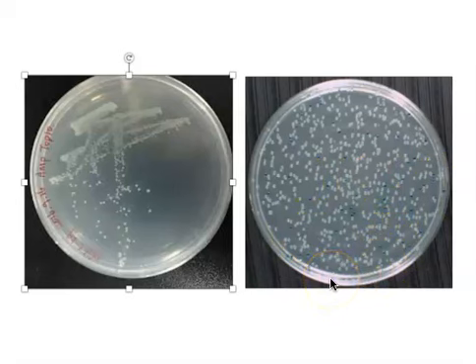Remember, we looked at the device that we use to do this, referred to as a hockey stick. It takes an aliquot of material, liquid material, and the hockey stick spreads it out evenly over the surface. The plate is then put into an incubator and allowed to grow.